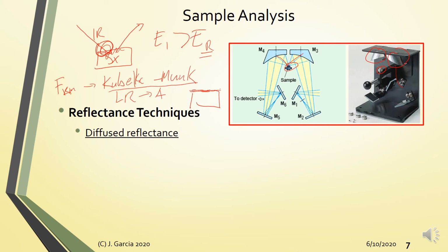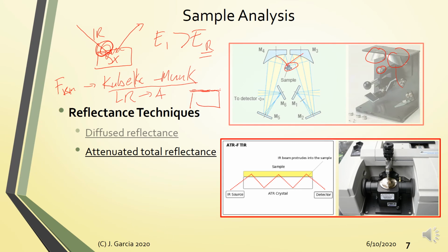Then next, you have your attenuated total reflectance. So instead of using KBr or powder sample, we make use of crystals. Alright, so the crystal can either be made from zinc selenide, germanium, or even synthetic diamond. Of course, this is more expensive, but the advantage of your diamond is that it's sturdier compared to these two, because these two can break pag masyado mataas yung pressure.